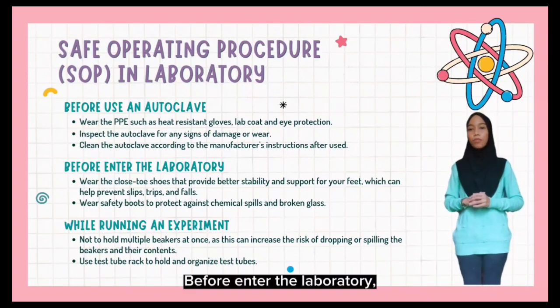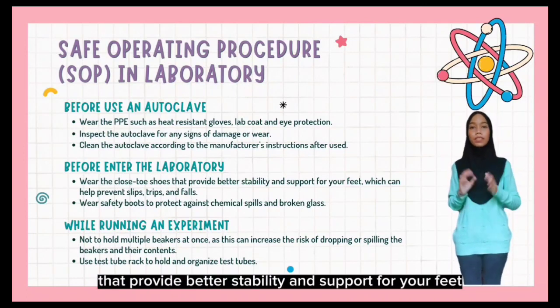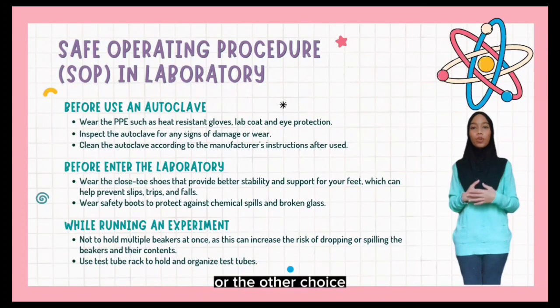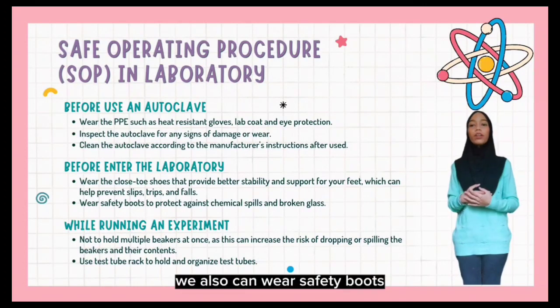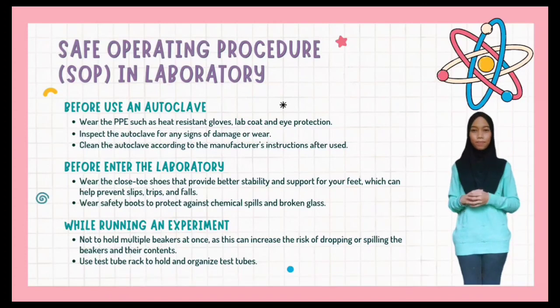Before entering the laboratory, don't forget to wear closed-toe shoes that provide better stability and support for your feet, which can help to prevent slips, trips, and falls. Or the other choice is we can also wear safety boots to protect against chemical spills and broken glass.